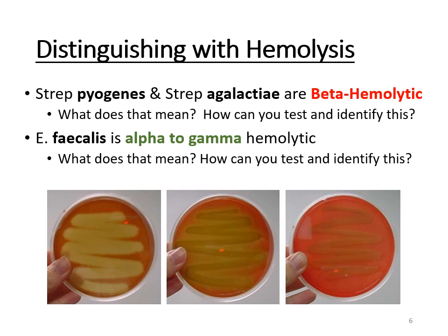Okay, so what you would do is you streak the bacteria on the blood agar plate and you look to see whether or not the bacteria chewed through the red blood cells. Is the growth now looking clear, with bright light coming through? Or did the plate stay fairly the same as before and only change slightly to a greenish brown color? So pyogenes and agalactiae, because they're beta hemolytic, would look like this plate. Clear, see-through, almost glowing yellow, right?